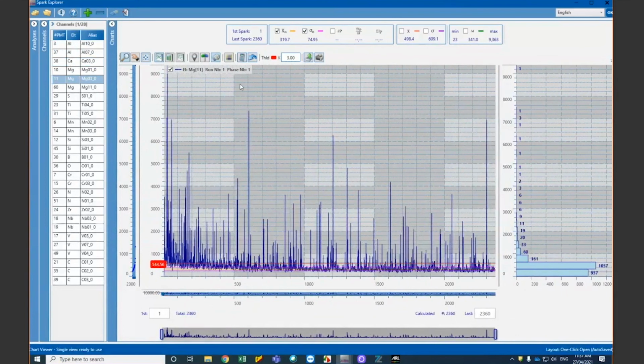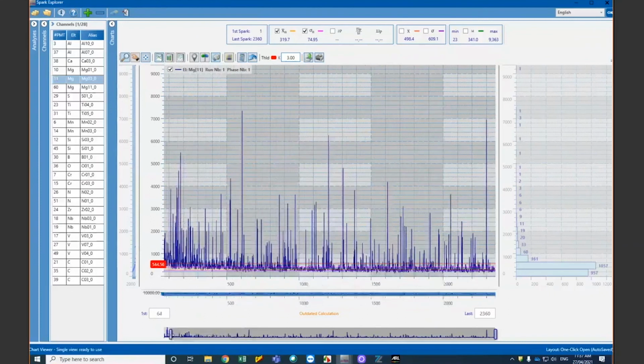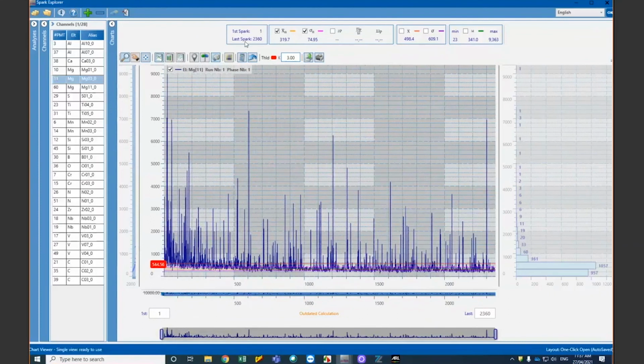The most important, you have some statistical calculations in this software. And you can decide which data set you would like to use in order to do the statistical calculation. That's here. And then you have the normal statistical calculations such as average, standard deviation, minimal, or median.